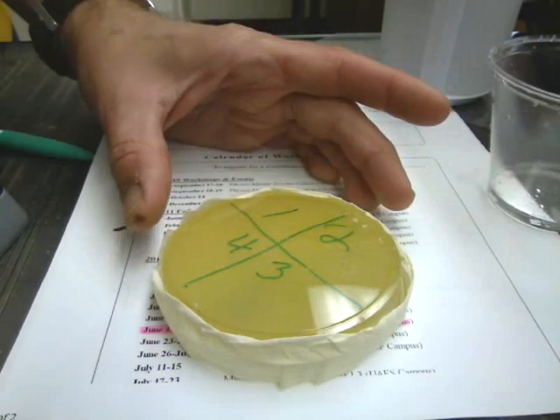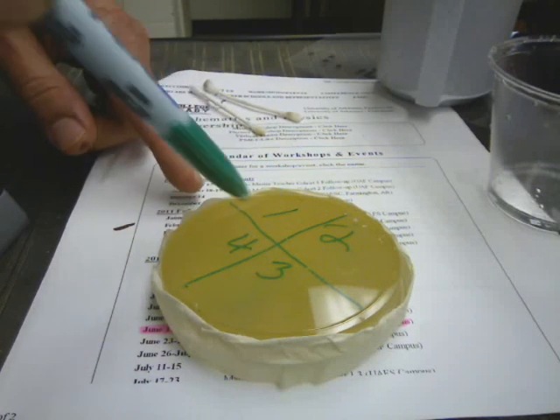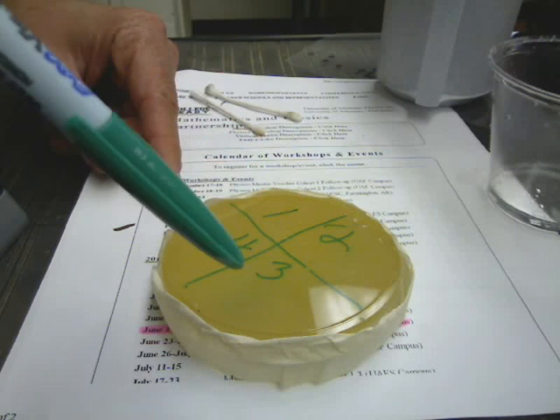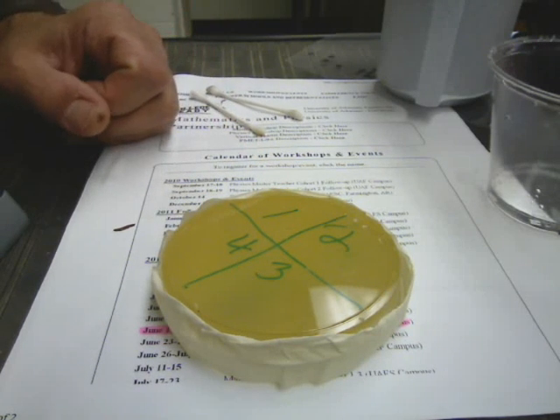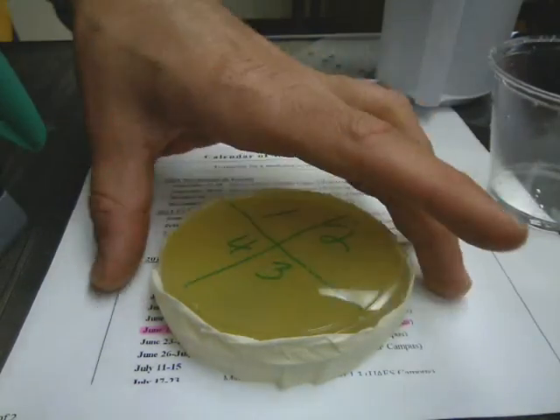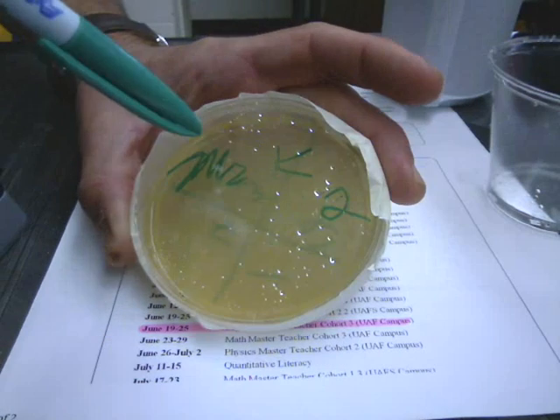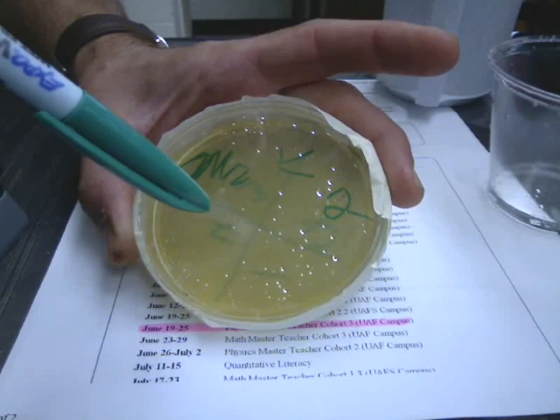What I'd like you to do first — if yours is not a divided dish, some of them are divided into fours — go ahead and divide it with a marker and label them one, two, three, and four. Then you'll have on your piece of paper something where you can record what you're putting in each zone. On the other side, put your initials of all the people in your group and what class hour you are in so that we can figure out which one is yours later.